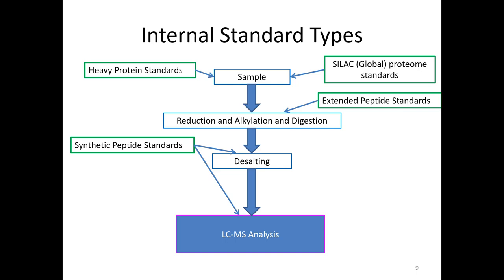If you use synthetic peptide standards that are already tryptic digested, they can be incorporated during the digestion procedure or after the desalting, and where they're put in will have an impact on what quantitative value you get out. If you put them in before desalting, then they will go through the desalting process and account for variability with your analyte. If you put them in after the desalting process, then they don't, and you don't get this variability addressed. You might have losses here that aren't accounted for. And so again, it's just not an absolute quantitation kind of way to generate values.